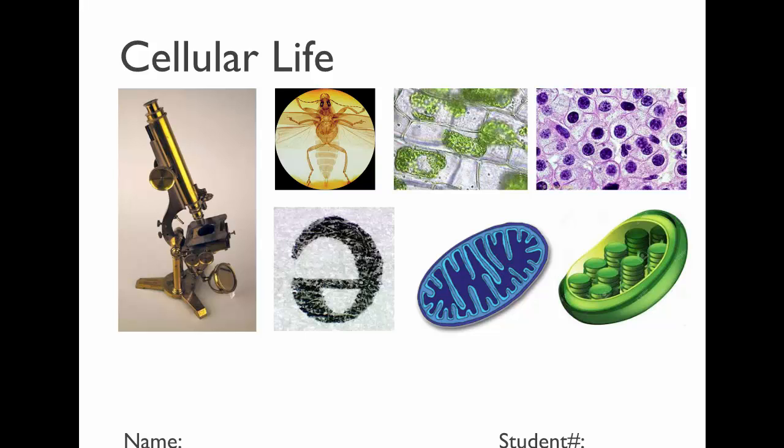In this unit, we do a bunch of different things. Starting with microscopes. So this is a microscope from, I don't know, probably the early 1800s or so. Microscopes have been around for a couple hundred years.